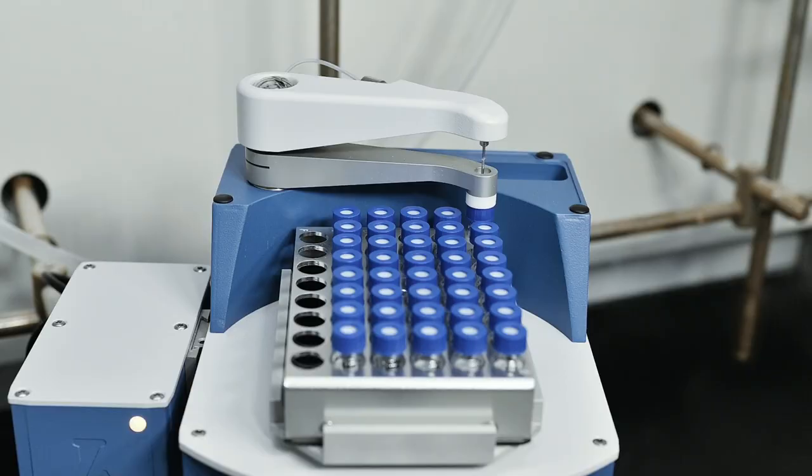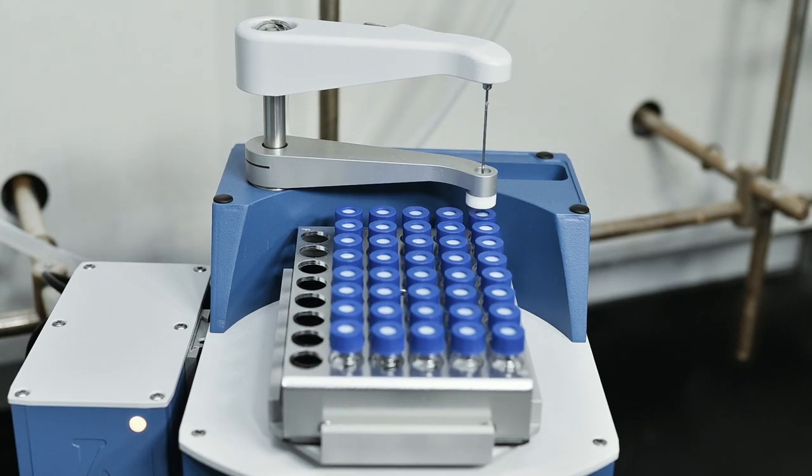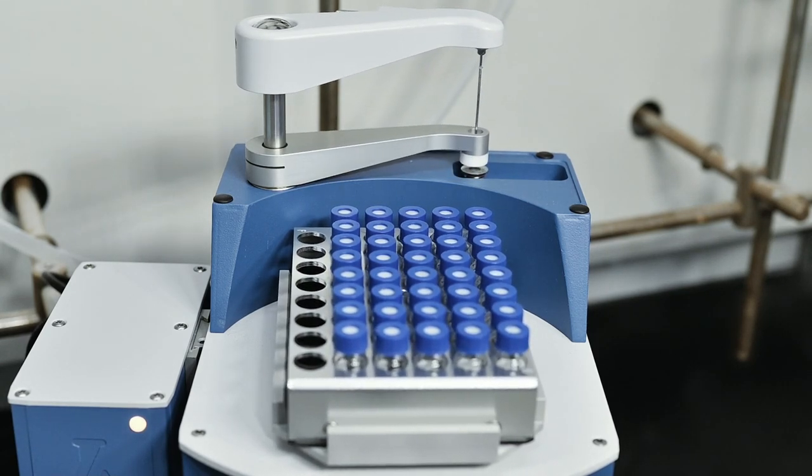Built-in shaking capability allows for sample mixing with a solvent or a quenching solution in the vial.